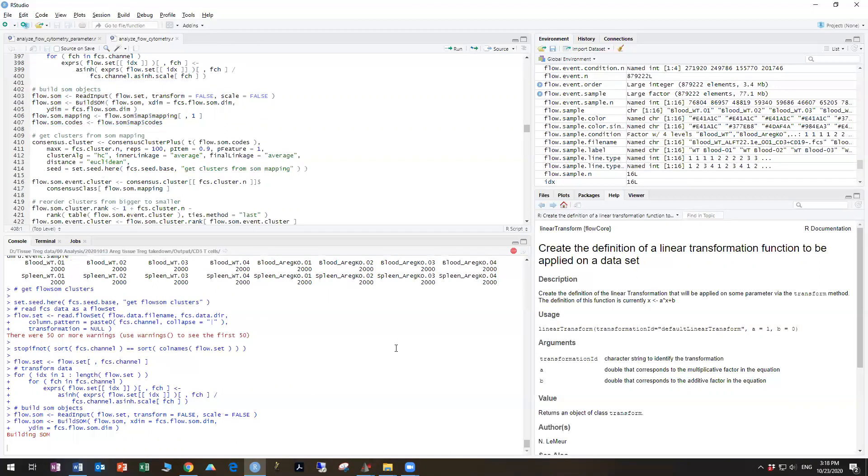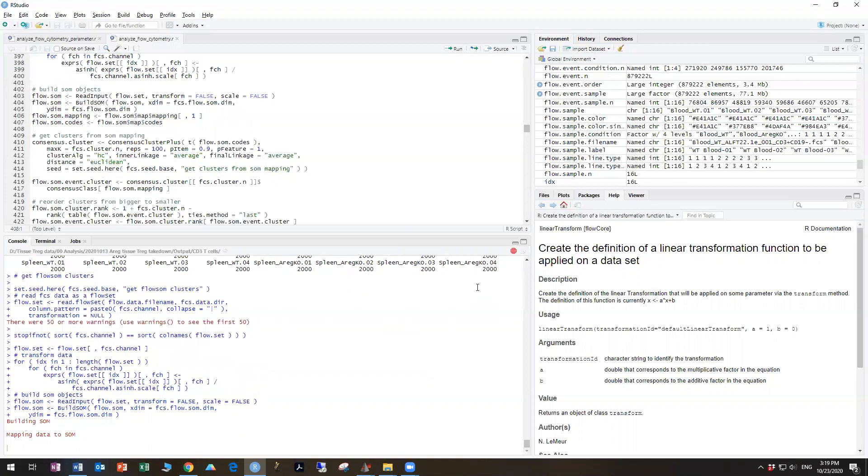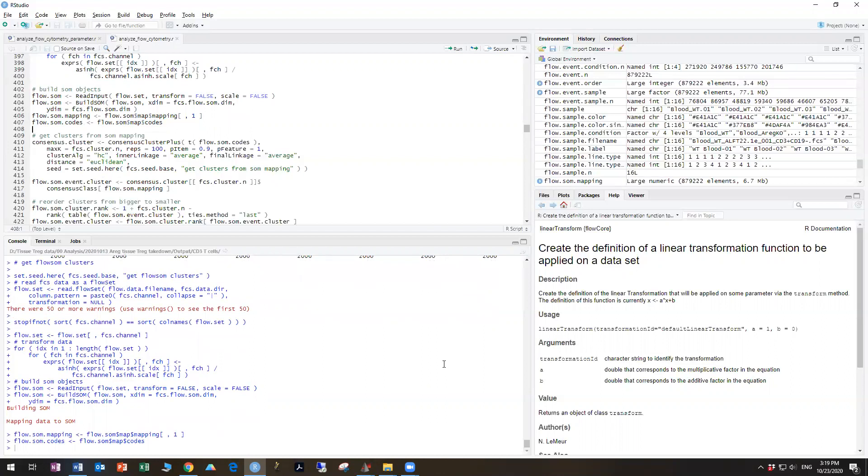Again, the length of time will depend on how much data you're trying to analyze. So now it's proceeding. All right, and that's done.